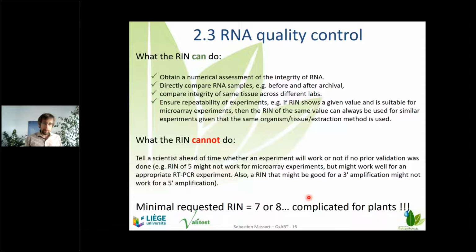What is important to have in mind, I will not go into details, is that it gives an overview of the integrity of the RNA. You can compare your samples together. But what it cannot say to you is that your sequencing will work for sure. It's a good indication that your RNA is of good quality, but you're not sure. You can do the sequencing actually.